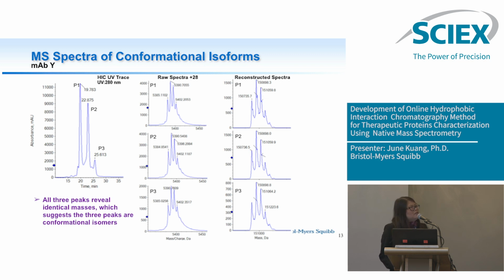The beauty of this method is that we can extend the study using hydrogen deuterium exchange to look at the protein architecture of this protein, and to see the folding states of each conformational isomer.